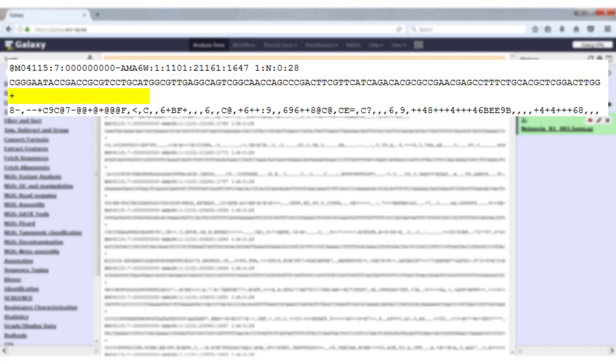The third line is a plus character, optionally followed by the identifier again. In many cases it will just be the plus, but sometimes you can have the identifier repeated.